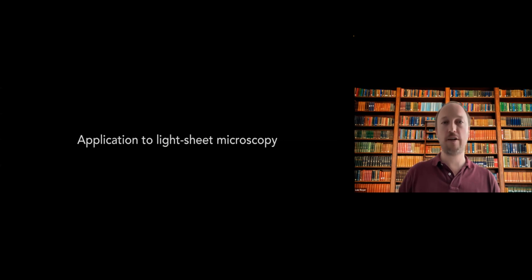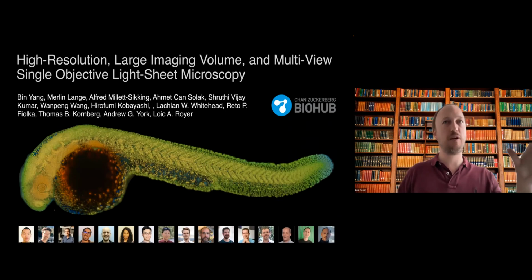And so there are definitely applications in light-sheet microscopy, and the ability to visualize very large data sets and access them through Zarr and Dask is key. And in a recent paper, we've been using that extensively for all the videos in the paper. And this is our work on single objective light-sheet microscopy.